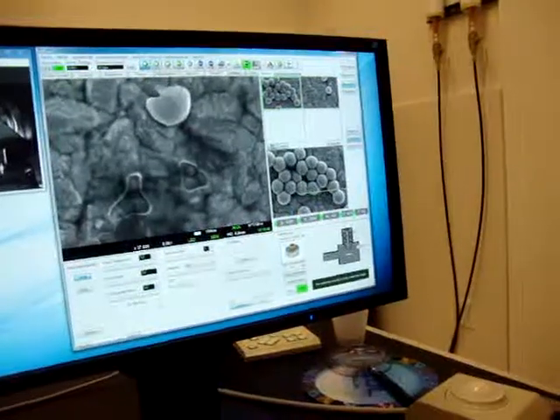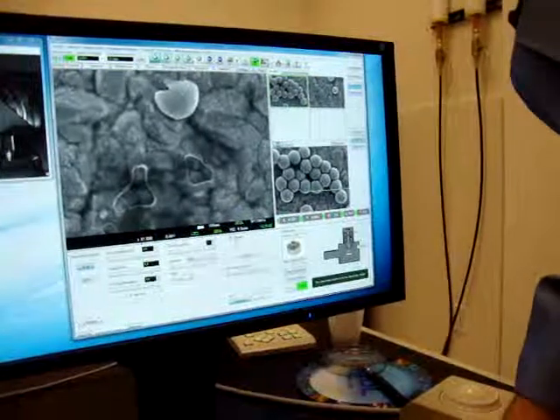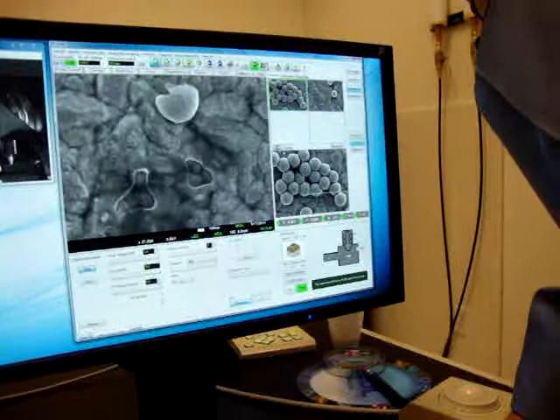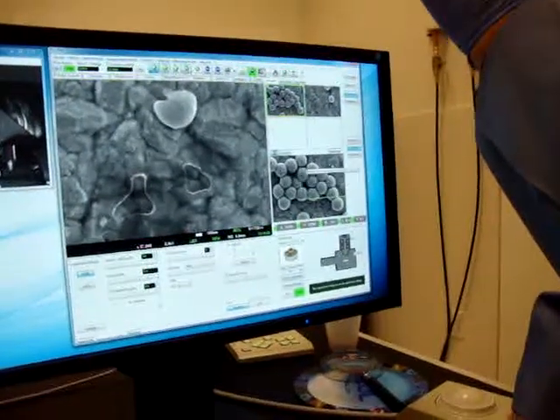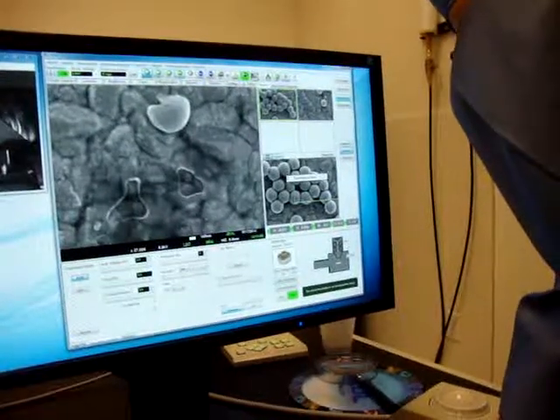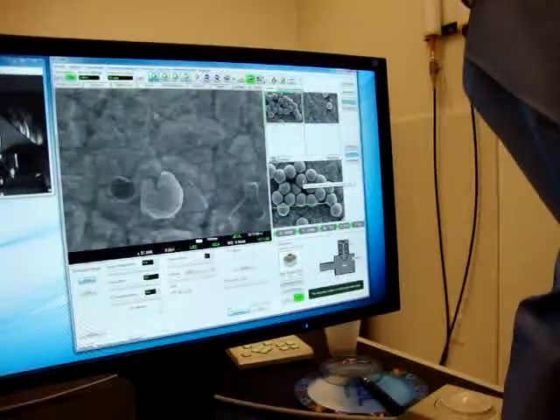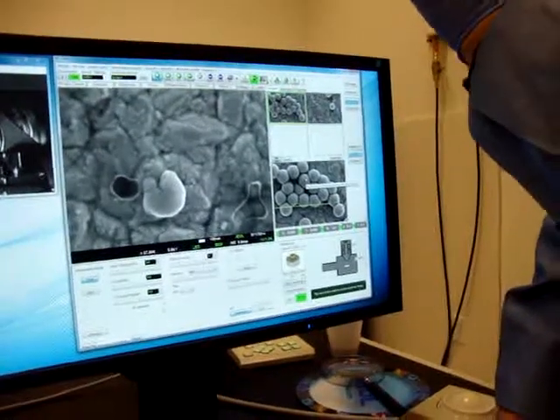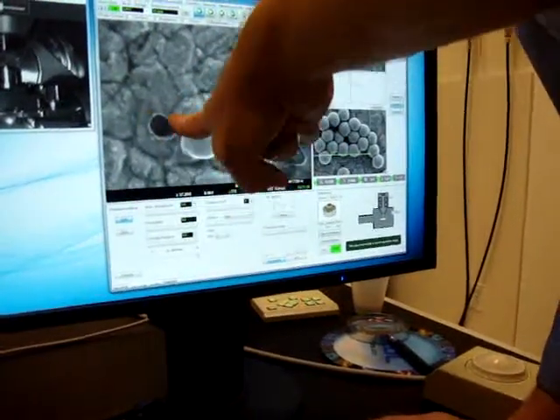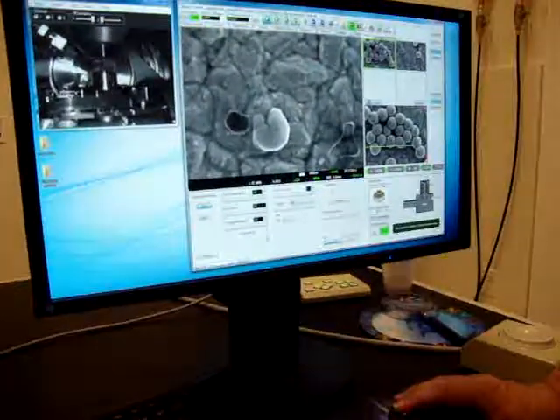I very seldom use it, but it took it to the center. We're looking at this part of the picture. No, because you got it deformed. No, this piece is moving. That piece is moving in the bin because you had those two, or no, is that another spot? That's another spot. You got those deformed ones.